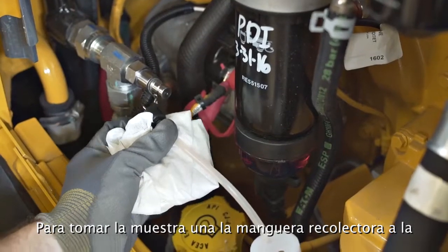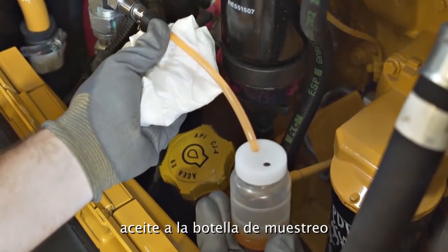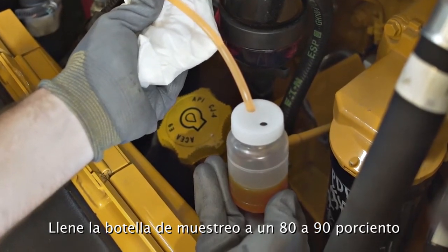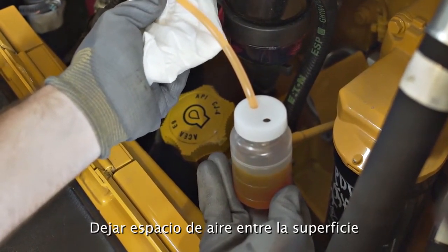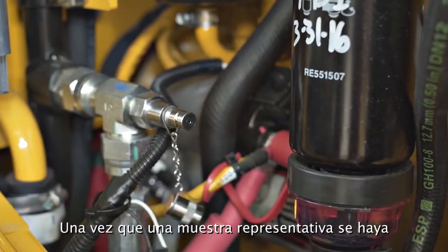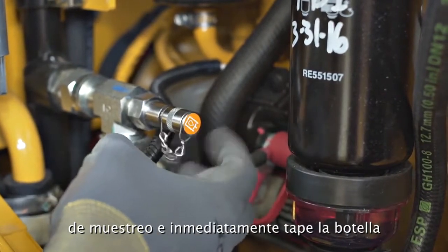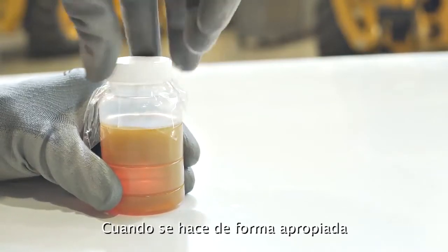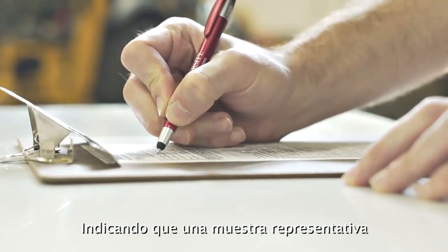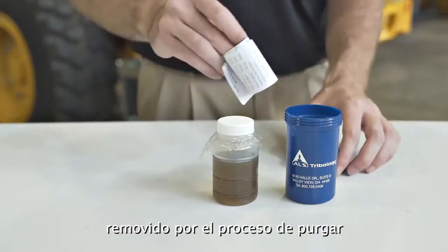To take the sample, press and hold the sample probe to the valve to release oil from the system into the sample bottle. Fill the oil sample bottle approximately 80% to 90% full. Leave some airspace between the top of the fluid and the top of the bottle. Once a representative sample has been obtained, remove the probe tube from the sampling port and immediately seal the lid to the container. When properly performed, the oil sample will be warm, indicating that a representative sample has been obtained and all stagnant fluid was removed during the purge process.